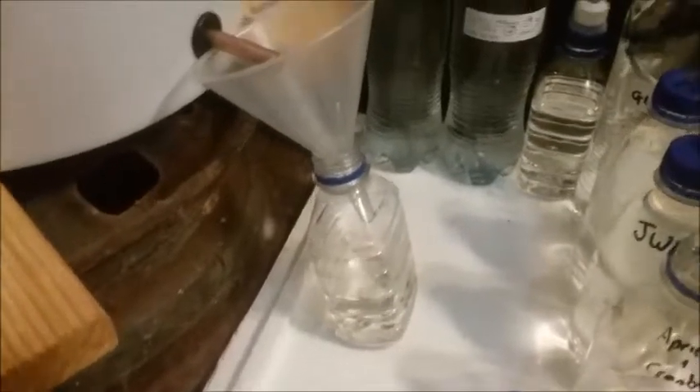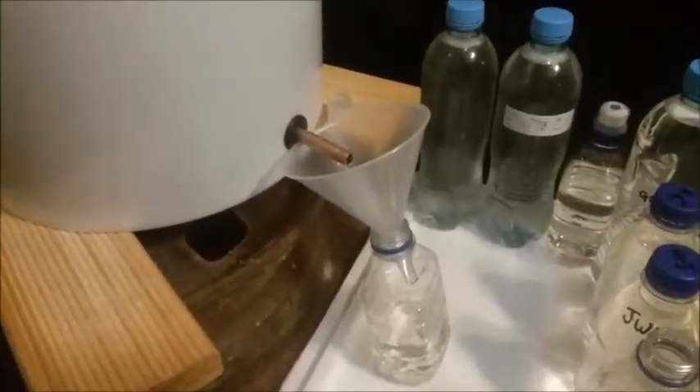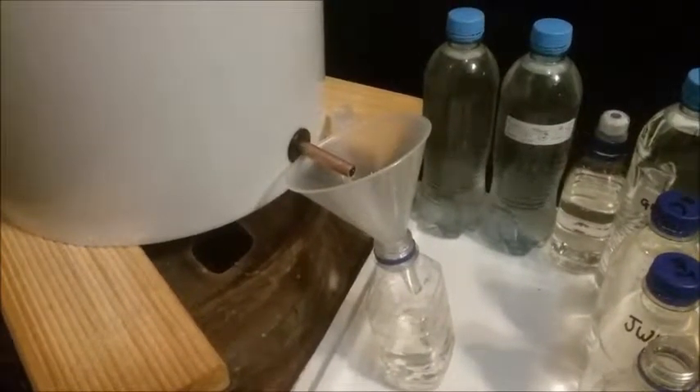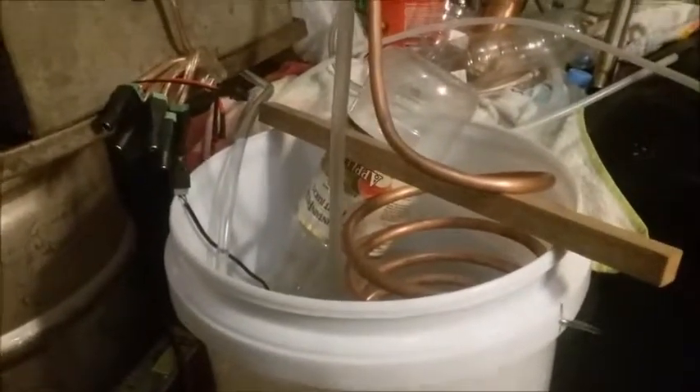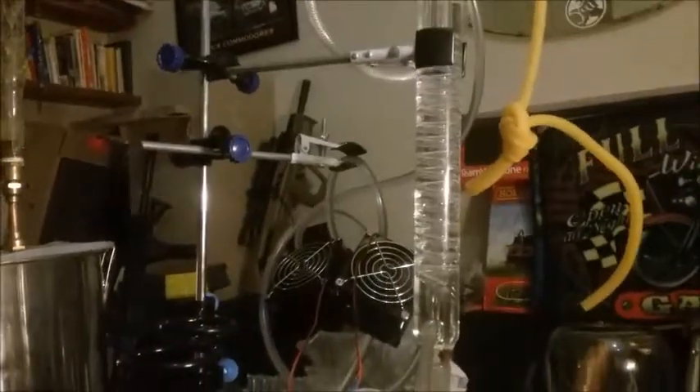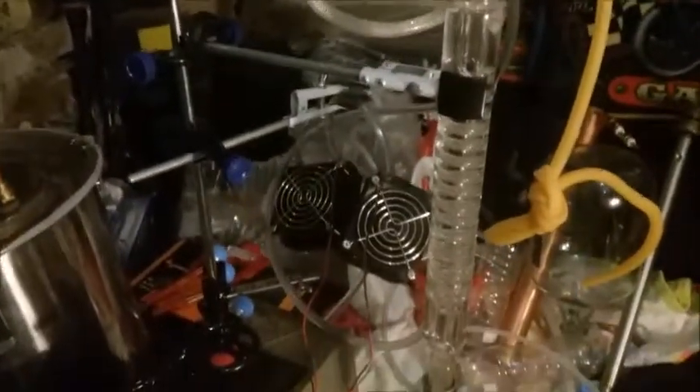G'day. I'm distilling some water, and this is the setup I've got. That bottle's just in there to hold the coil in place. There's the bottom spiral, a little bottom condenser, the spiral condenser, and then the bubble condenser, and then the main condenser. It's bubbling in there, so I'll just turn that off for a moment.